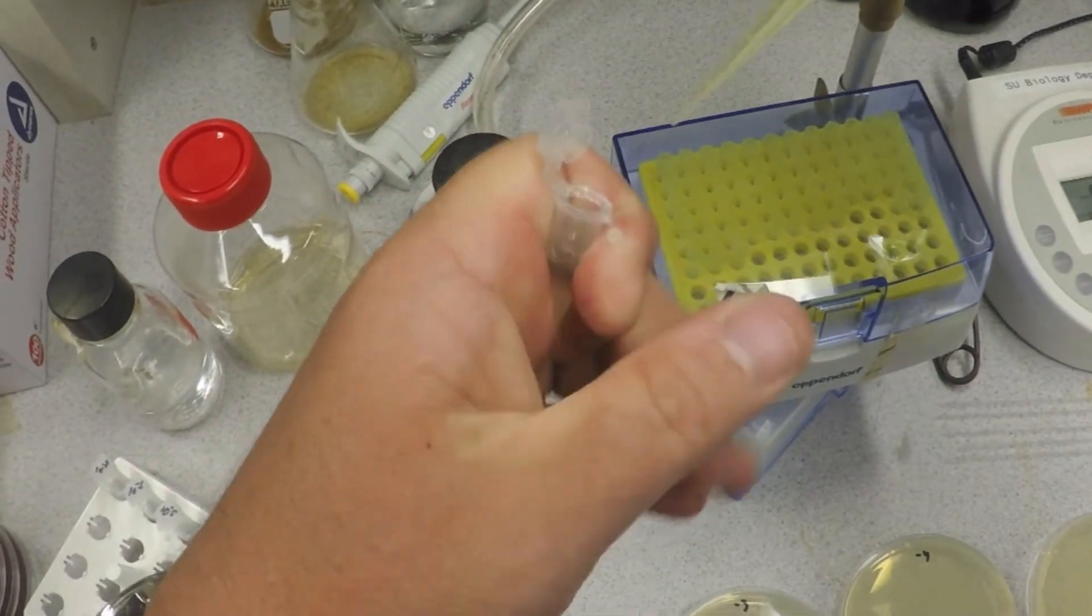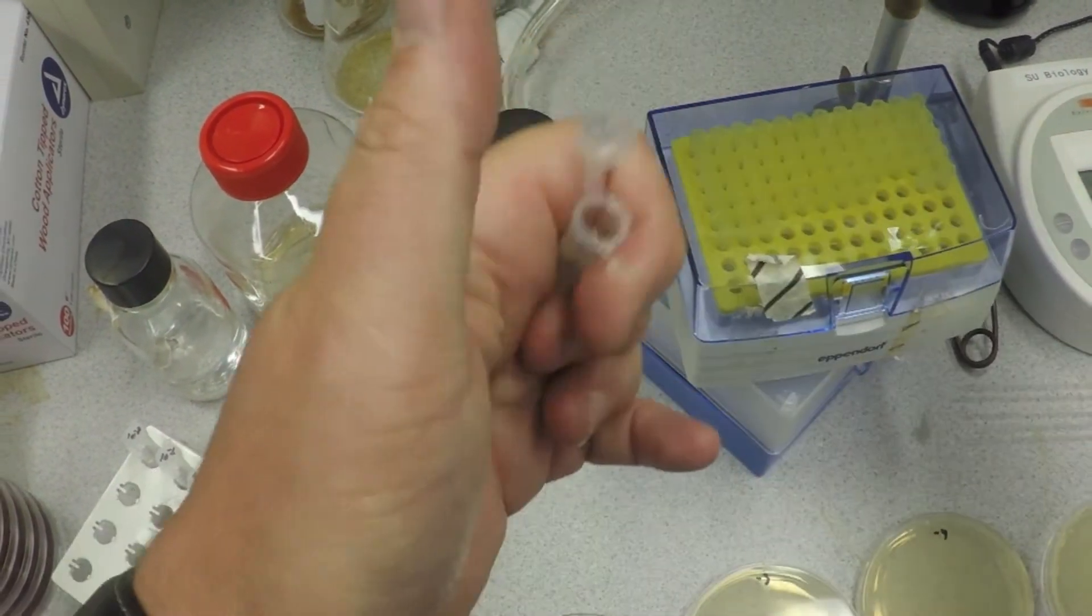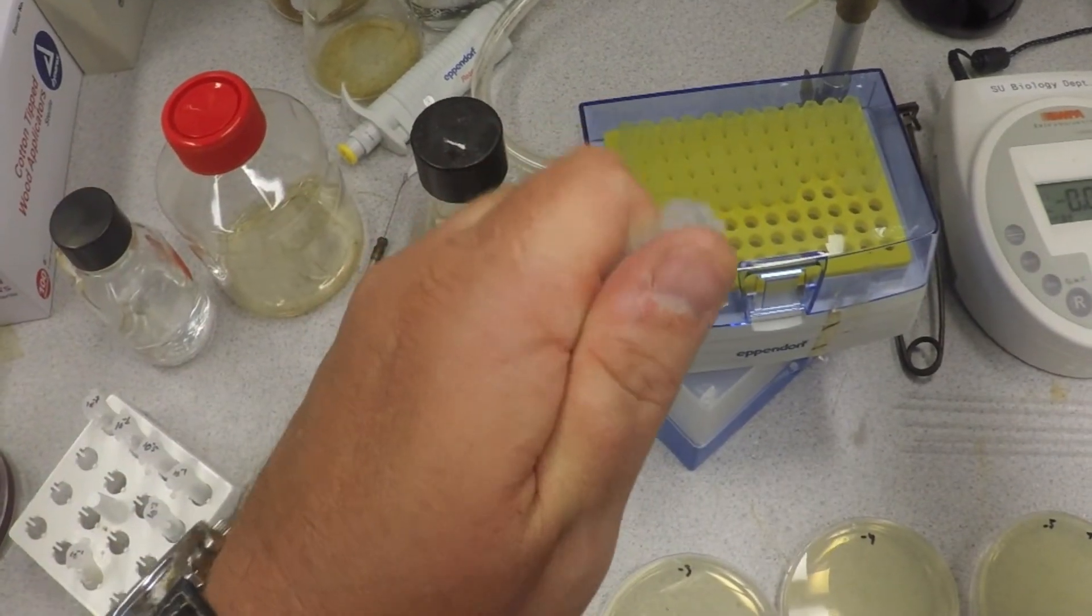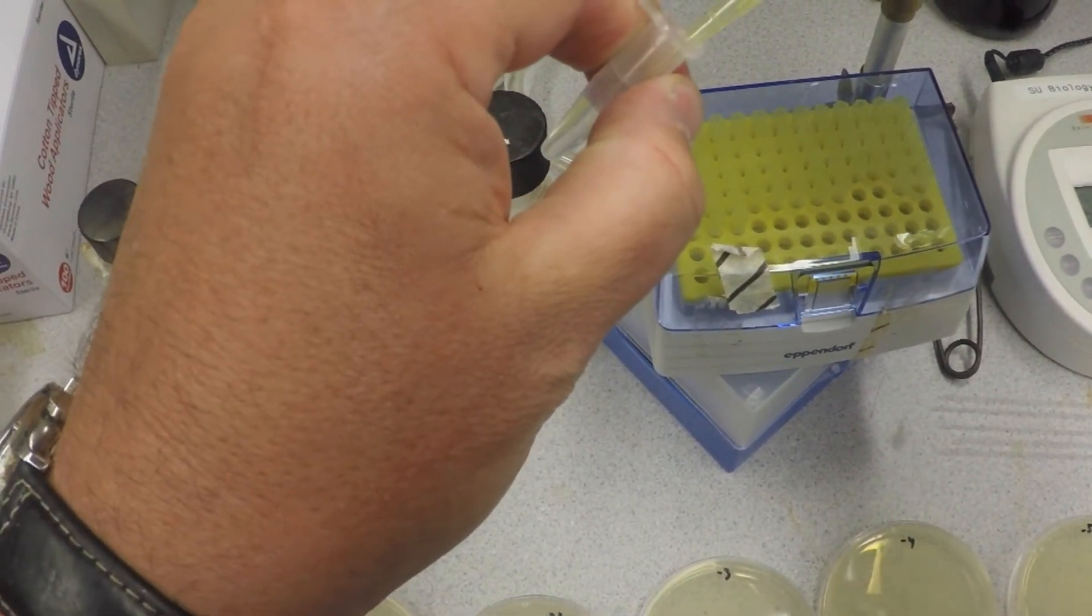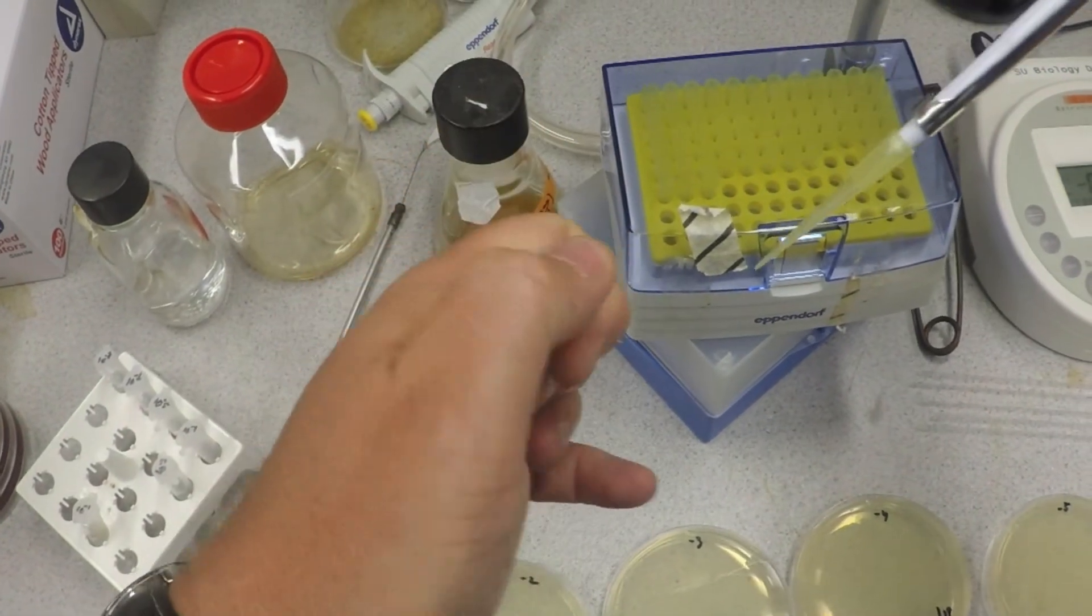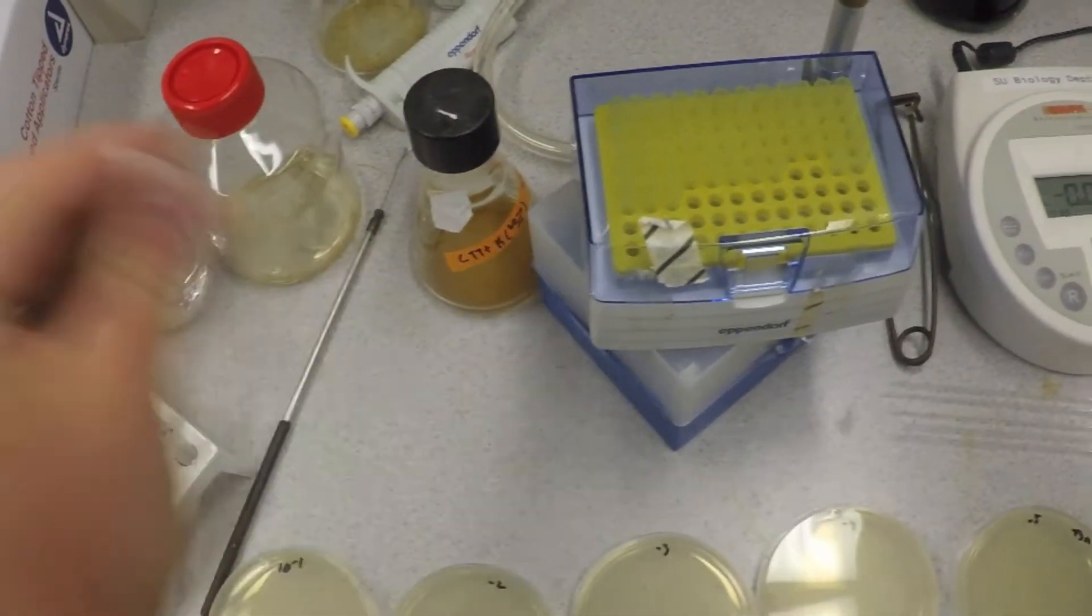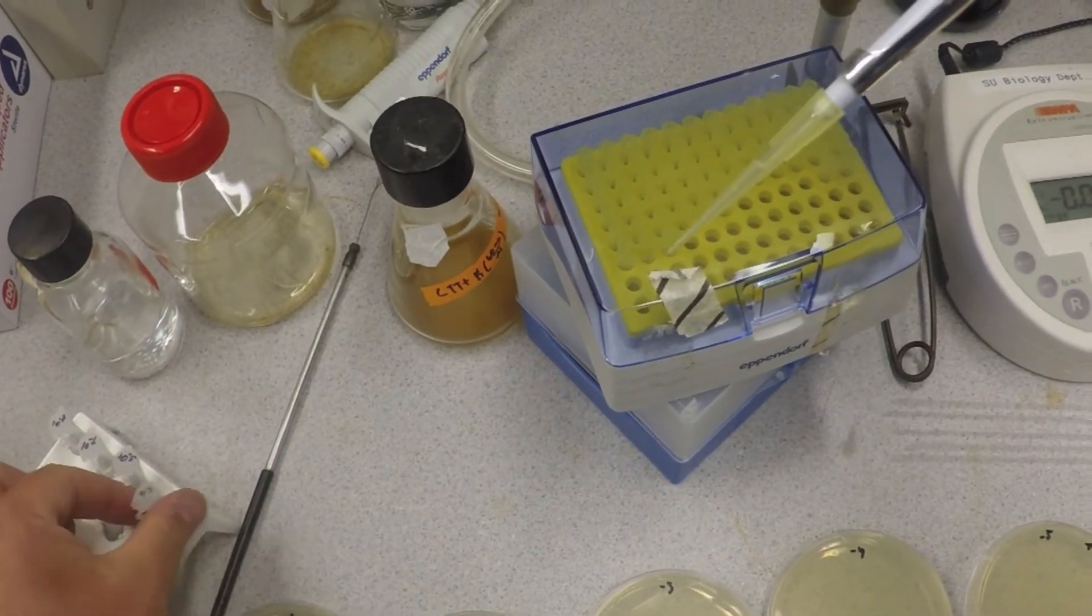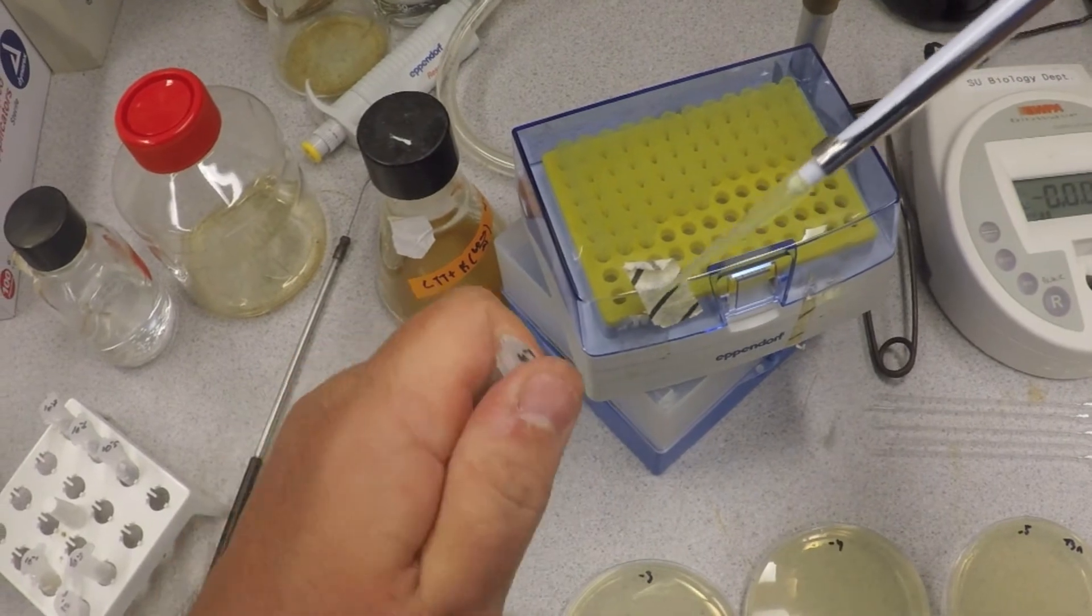We take 100 microliters this time from here and put it into the 10 to the minus 2, or the 1 to 100 tube. Pipette a few times like before, get rid of the tip, shake it up a little bit, and you do this until you have all of your dilutions set up. We'll come back when that's done.